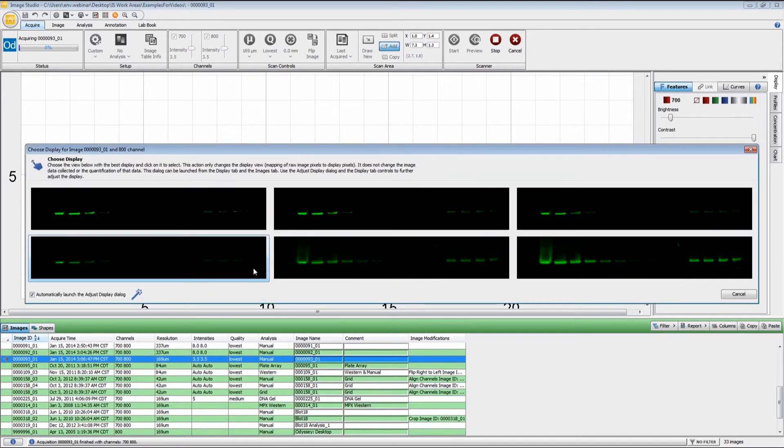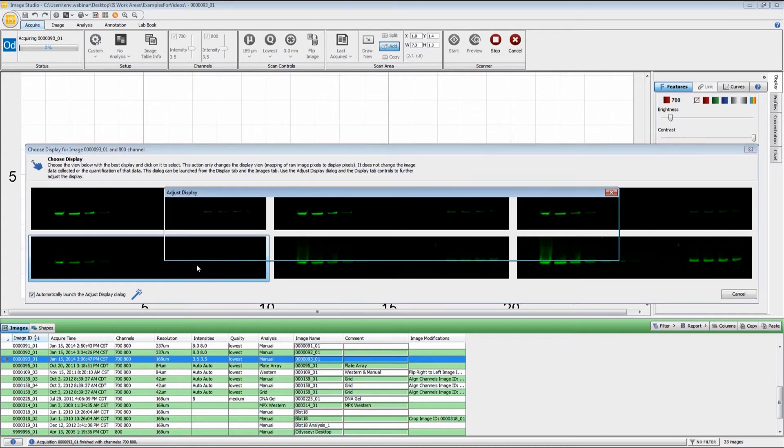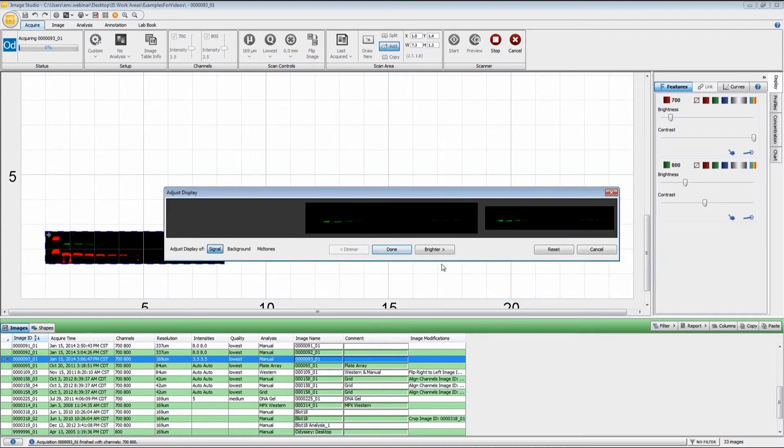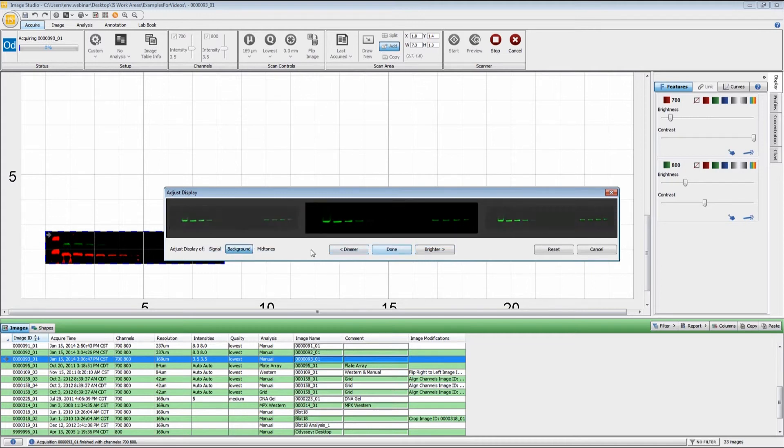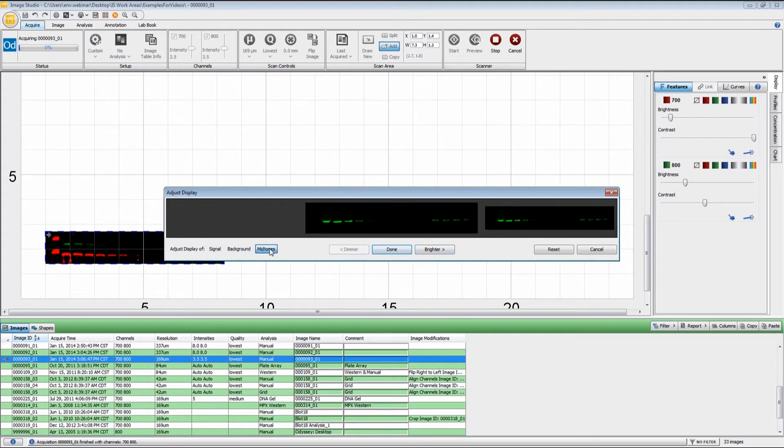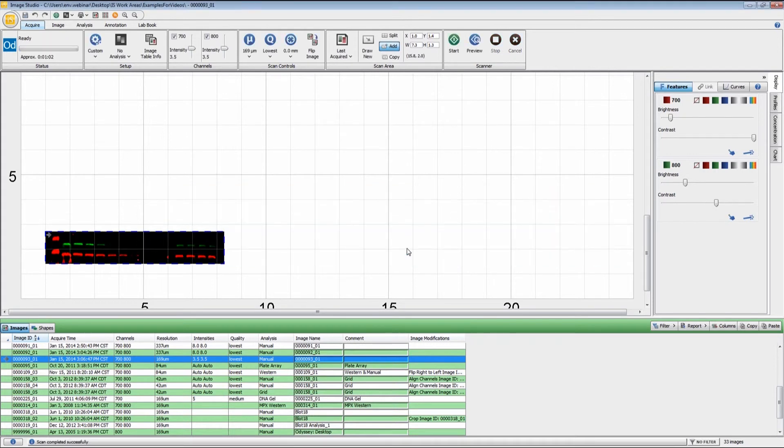When I click done, it takes me to the same set of options for the 800 channel as well. I click on one of them and then I can adjust the overall brightness, the background threshold, and then the midtones.